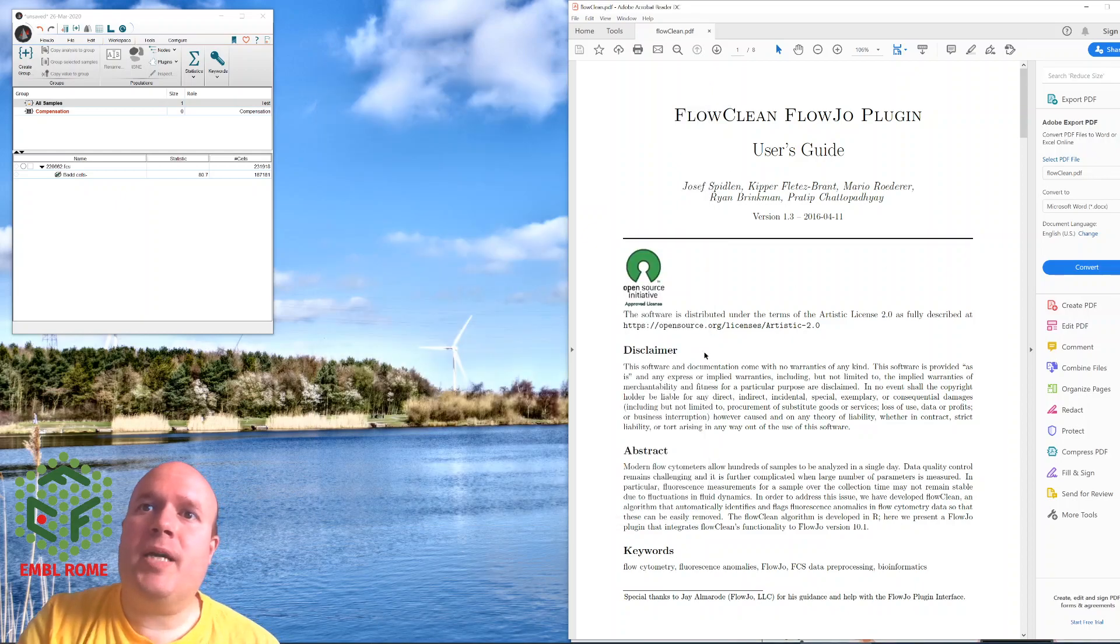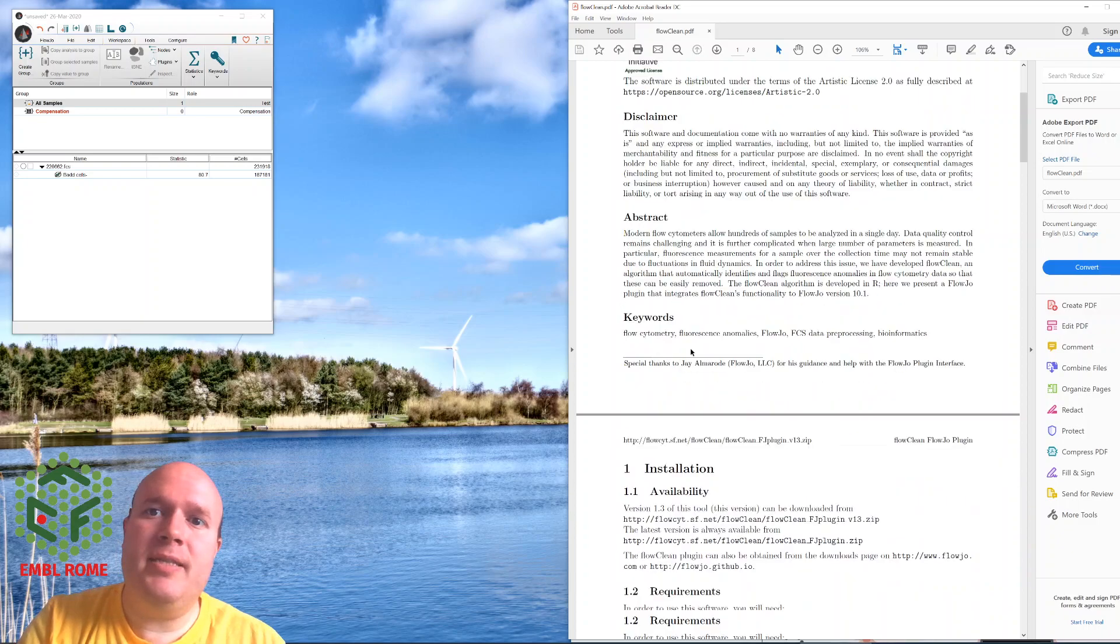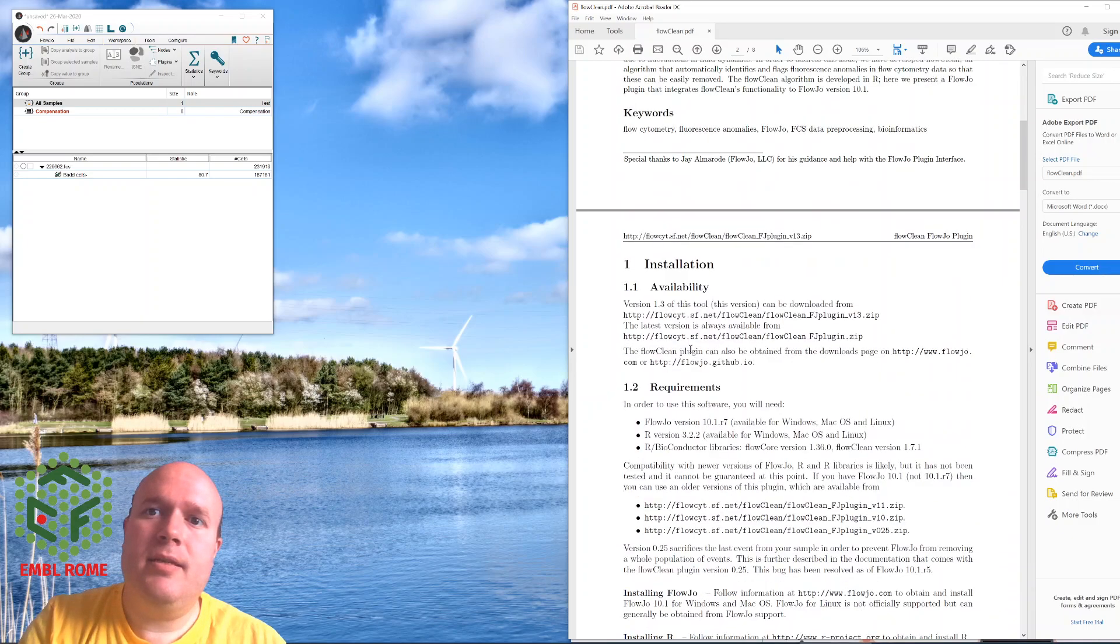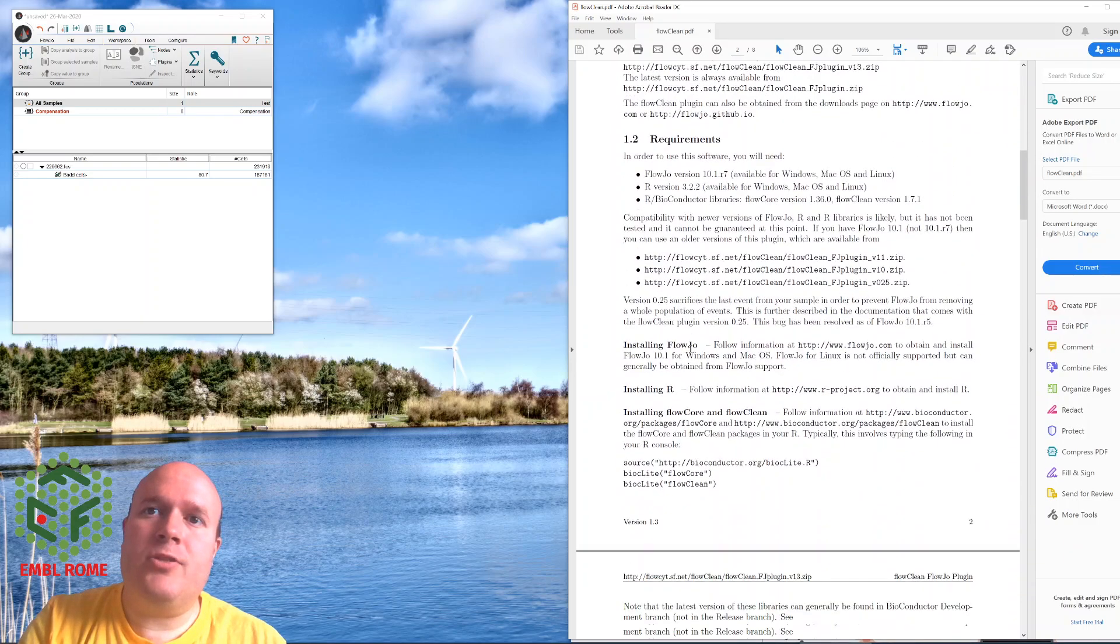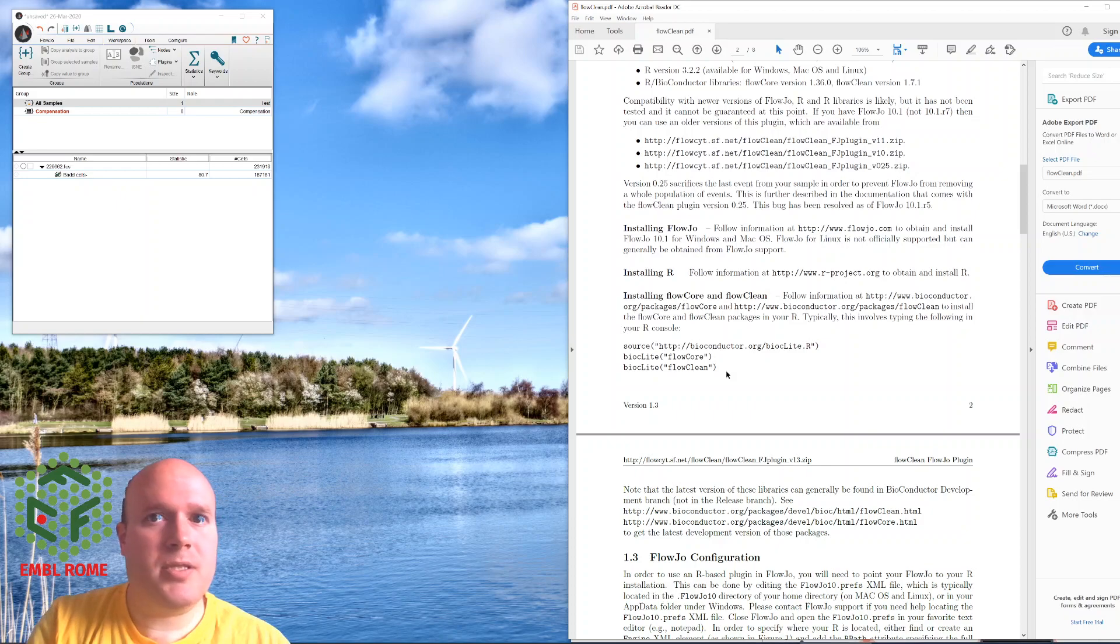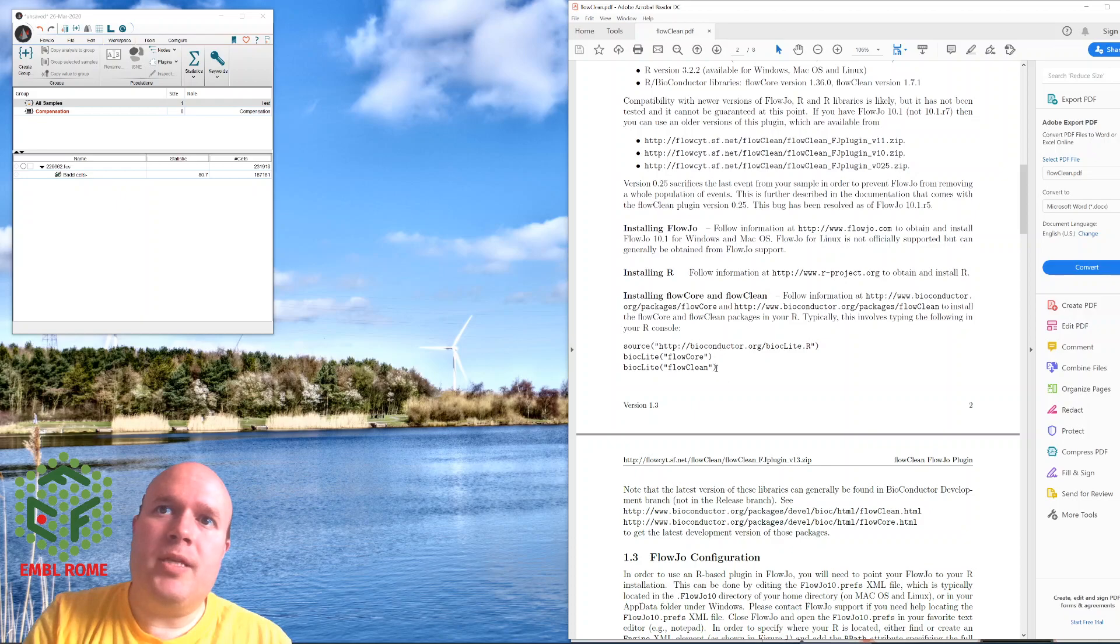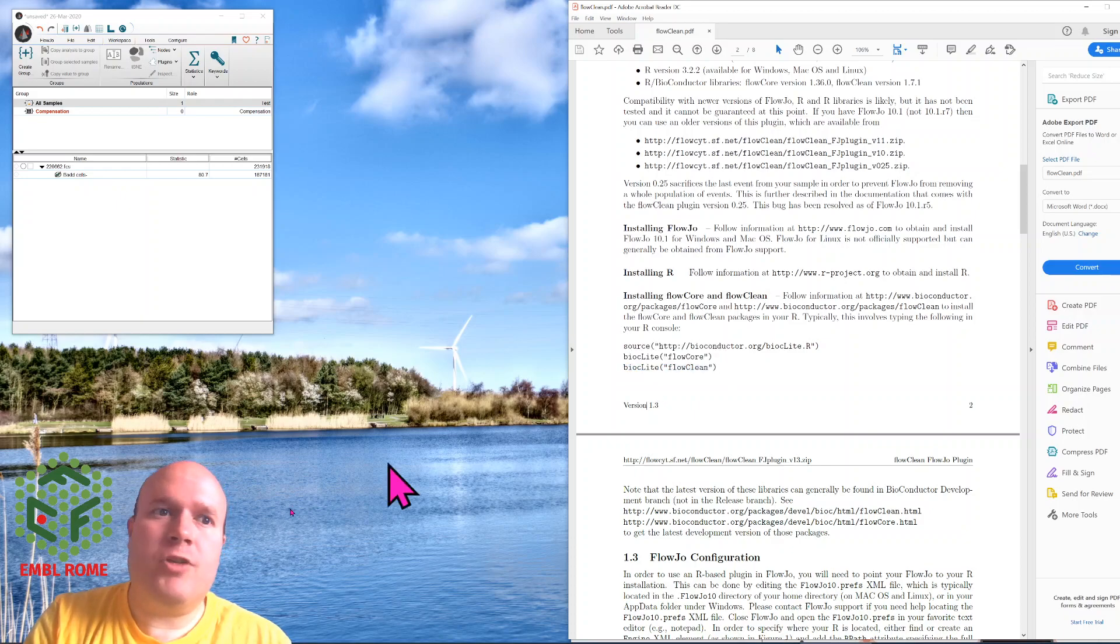Back in the instructions, it tells you what FlowClean is and some instructions. As I said, what FlowJo does is it loads R, does the processing in R, and brings it back into FlowJo. So you will need the FlowClean package in R. You have to run R first.